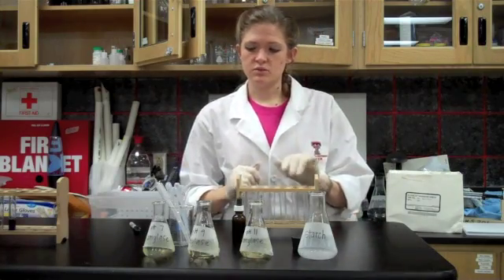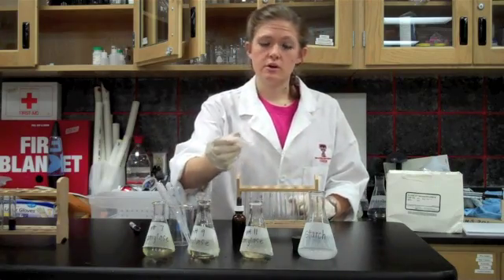And in the other three test tubes, I'm going to put one milliliter of the starch solution.